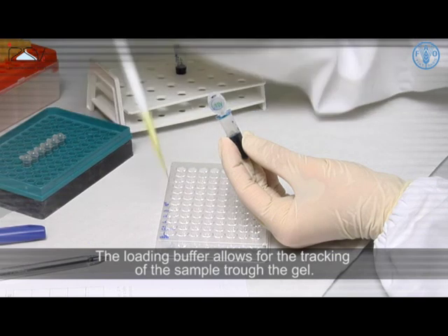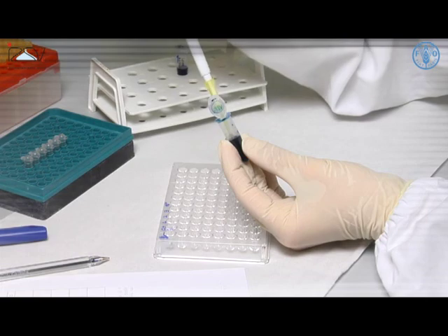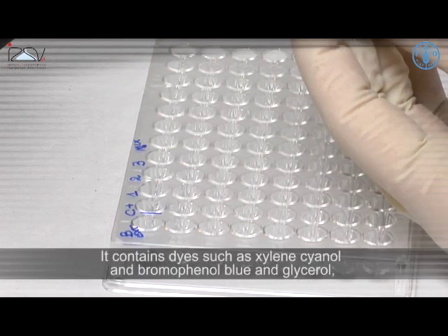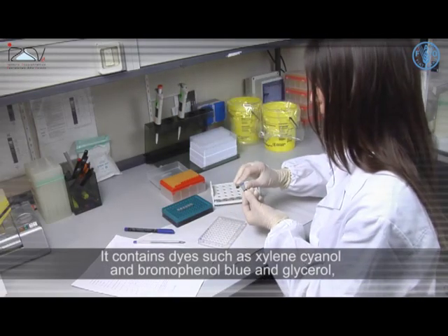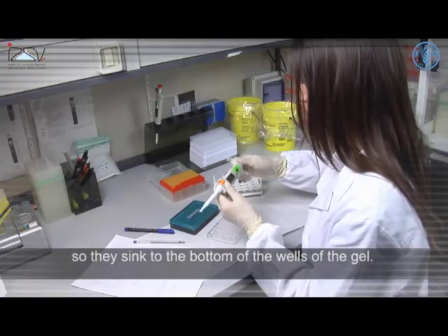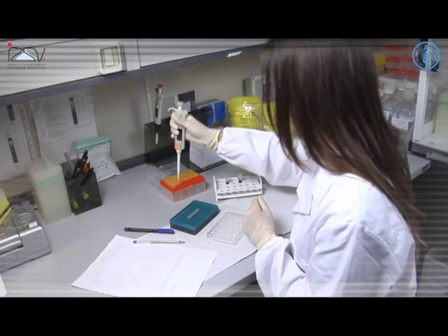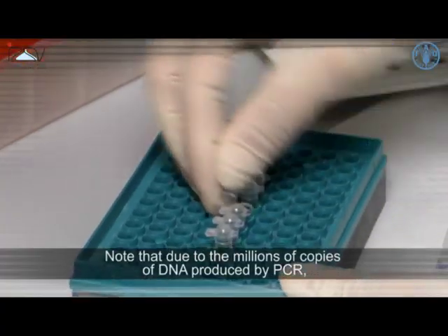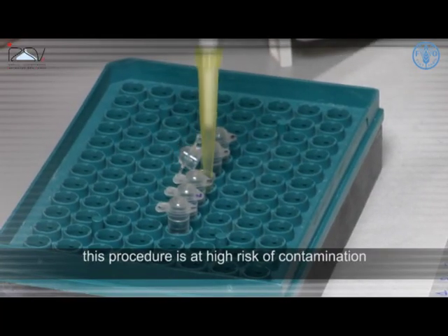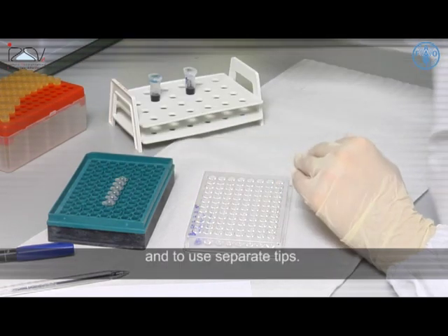Prepare the samples for the electrophoresis run by mixing 5 microliters of sample with loading buffer. The loading buffer allows for the tracking of the sample through the gel; it contains dyes such as xylene cyanol and bromophenol blue, and glycerol, which renders the samples denser than the running buffer so they sink to the bottom of the wells of the gel. Note that due to the millions of copies of DNA produced by PCR, this procedure is at high risk of contamination, and it is strongly recommended to open one PCR tube at a time and to use separate tips.